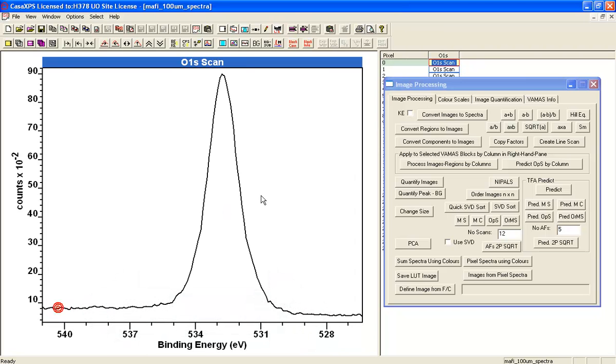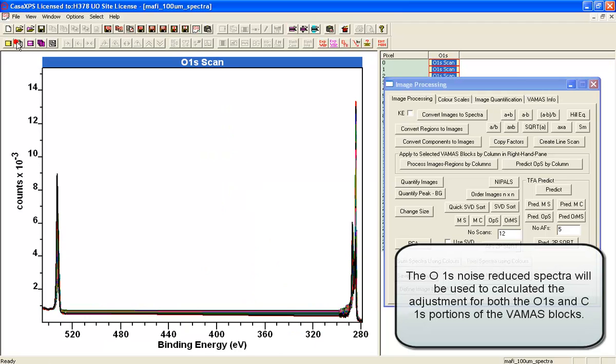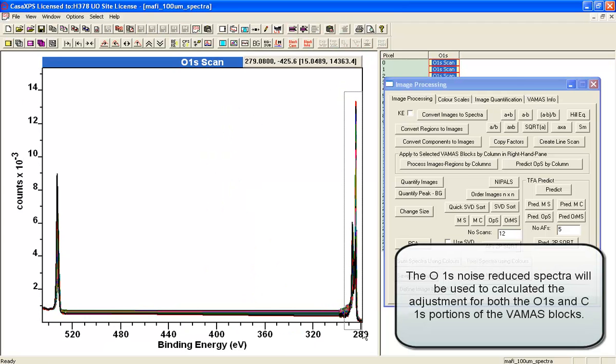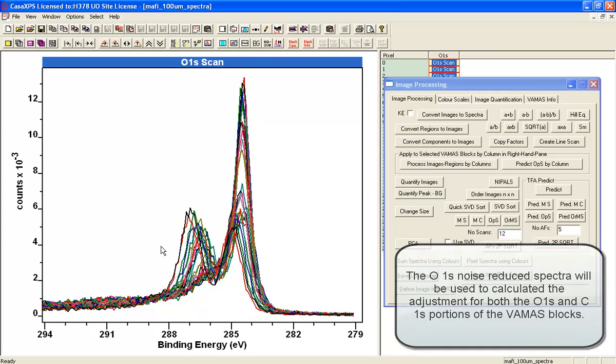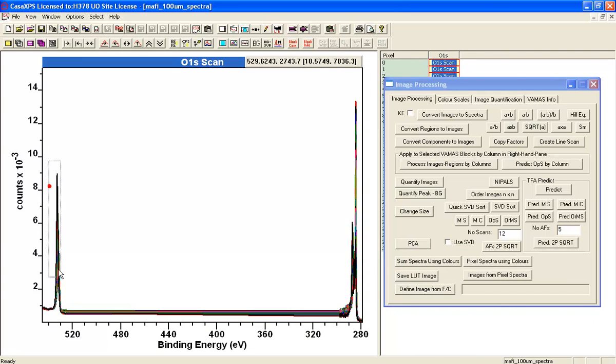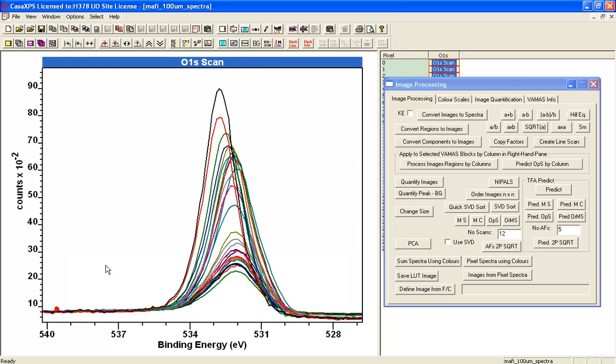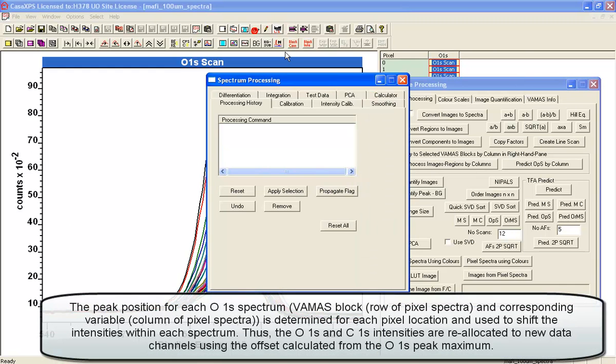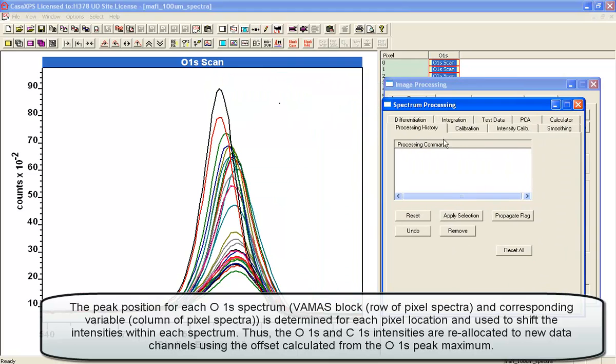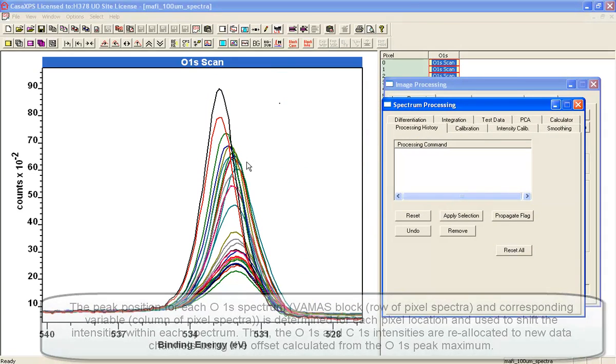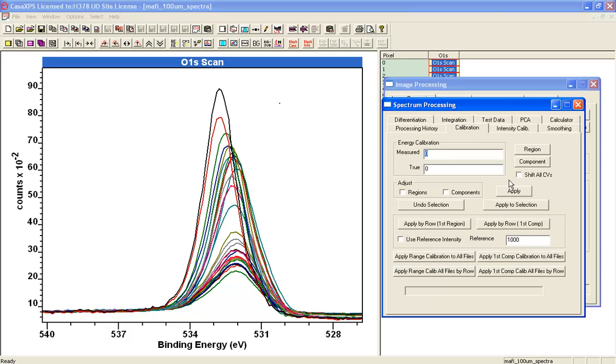I've got the noise reduced oxygen and similarly I've got the original spectra for the carbon 1s. What I'm going to do is a different way of charge correcting to allow for the fact that these spectra are just one column—the ones that you see here are just one column of pixels in the image, and what I need to do is shift every column.